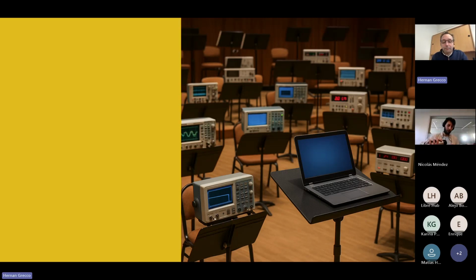in our experiments. If we do that correctly, we win a great battle, because the software to control instruments would be like a protocol, not a protocol that we follow, but a protocol that the computer follows, and therefore makes experiments much more reproducible, auditable, and we can have a good log of everything that has happened.